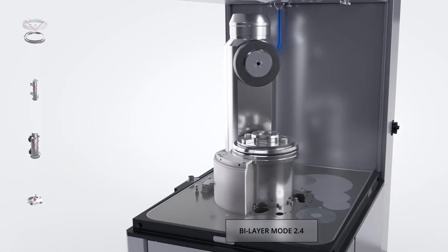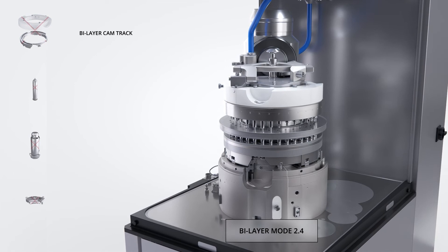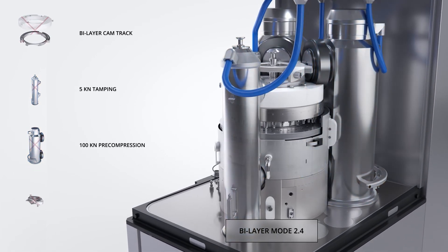Bilayer mode 2.4 is ideal for special applications where a high level of pre-compression is required to make the final bilayer tablet.